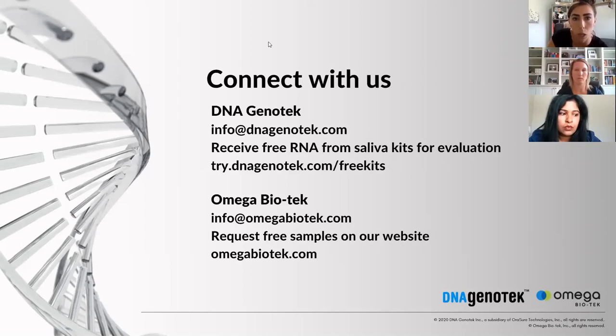Great. Just looking at some other questions that have come in: is there any reason why your study was conducted with a coronavirus that causes a common cold and not SARS-CoV-2? Sure, I can answer that. To conduct experiments with live SARS-CoV-2, we need BSL level 3, and you need a lot of restrictions with regards to who can process those samples. Also, since we are an extraction company, we want to make sure that we don't bring SARS-CoV-2 transcripts into the lab facility. The coronavirus 229E belongs to the general family of coronaviruses, and it's also an RNA-based virus like SARS-CoV-2. So we chose that to be a good representative of SARS-CoV-2 and decided to do experiments with that.